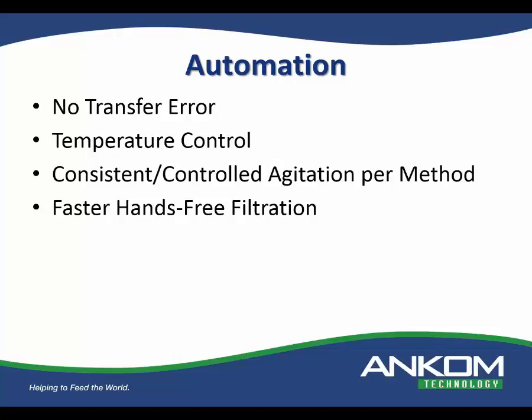There's no scratching, no stabbing, very consistent. And again, automation in general is removing all of these variabilities and it's going to give you more precise and more accurate results. Yeah, we've probably majored on improvements that automation gives that are pretty obvious, but it's just important for you to see. There is a huge difference in this.